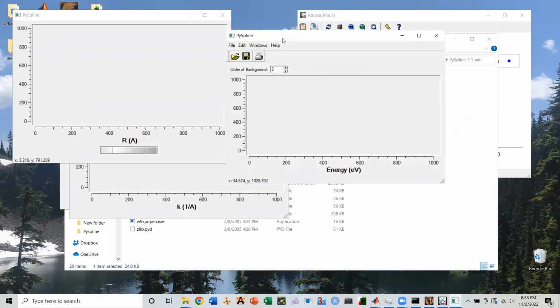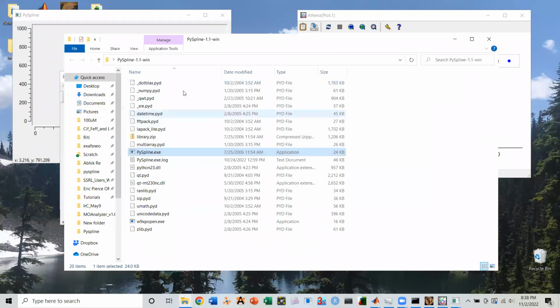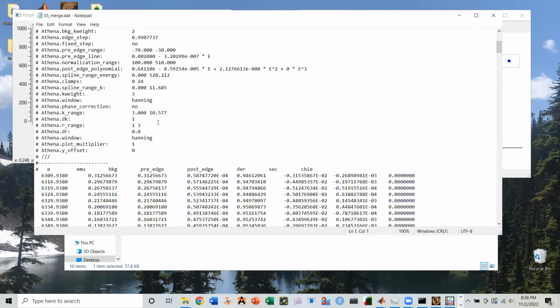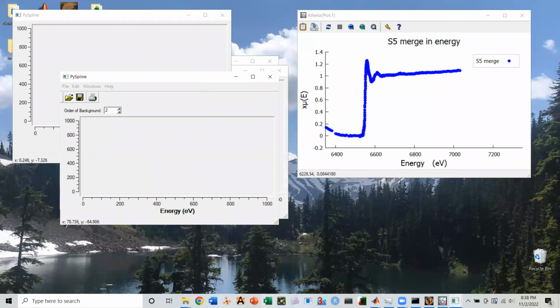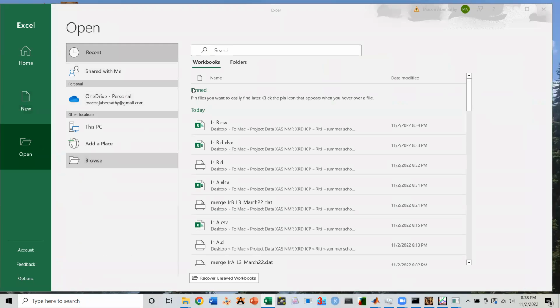In this case, oh, something didn't like that. Maybe I hit a wrong button. Okay, let's take a look, see what's going on. Oh, I'm sorry. You know what? I'm getting ahead of myself. Sorry, we've got to do the normalization thing in Excel. So let me just open this up really quick.